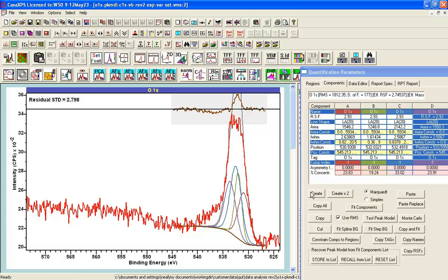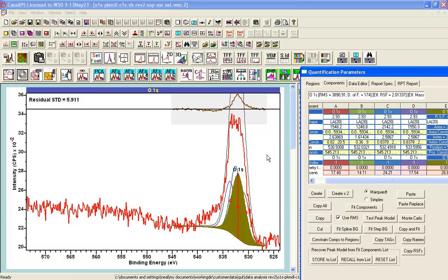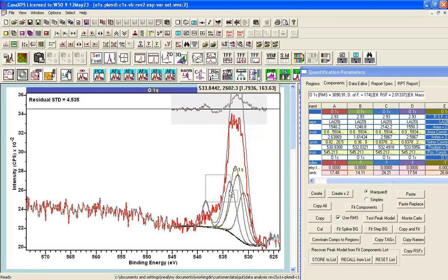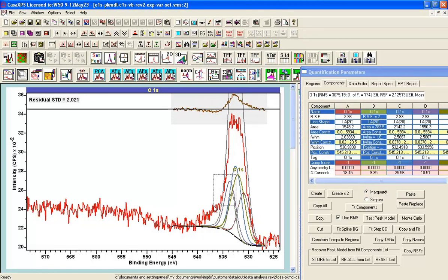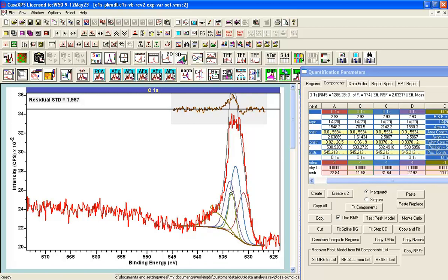When you have a ring structure, you also see additional peaks that are shake-up and shake-off type peaks — loss peaks as opposed to the zero-loss peaks we can identify with chemical state. In order to accommodate four peaks here, I'm going to have to put in another feature to make the peak fit work, so I'm actually going to add five components.